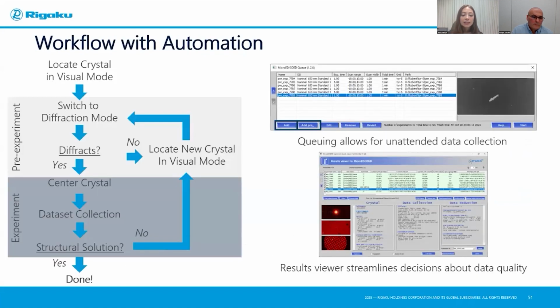And so taken together, this is not a comprehensive look at all the automation we've implemented within XtaLAB Pro, but I would say when you're just getting an overview of the technique of 3D-ED, these are 2 really big ways that we are implementing them into this workflow. Although there's all sorts of other interesting automation features that we have implemented as well, but I just don't have time to get into all of those today.